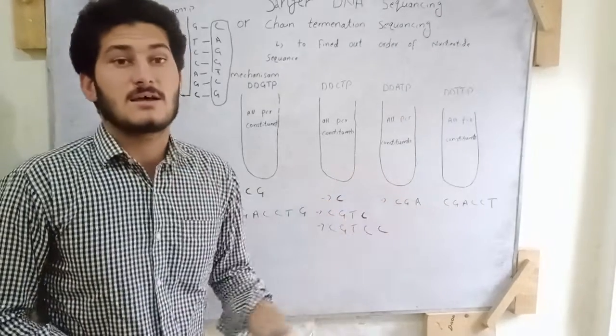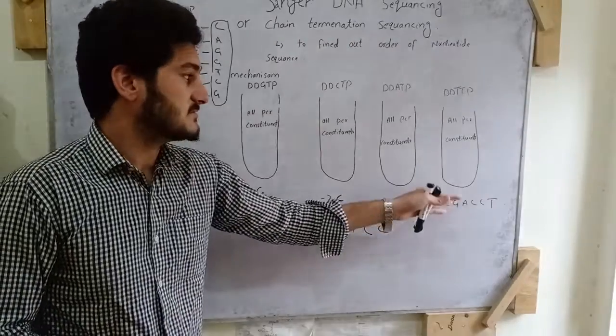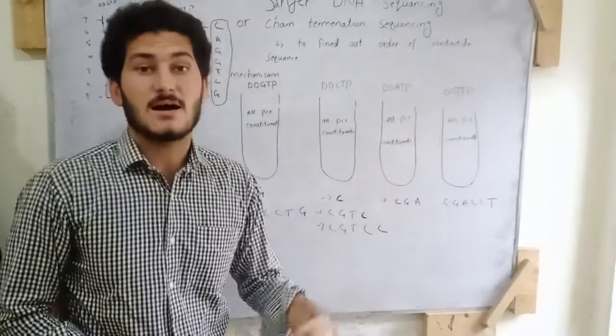The other amplification cannot occur because the dideoxy TTP is attached.